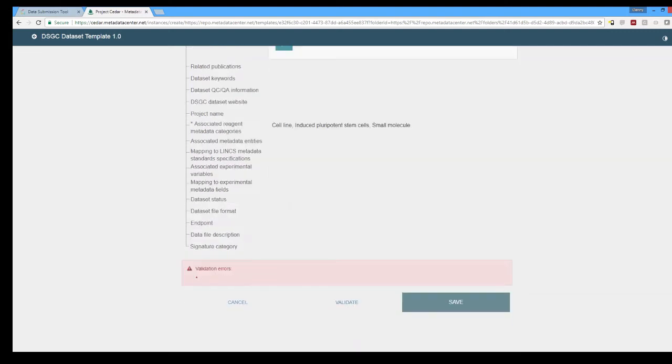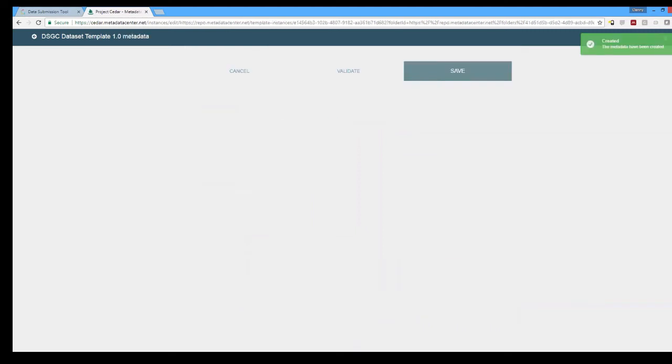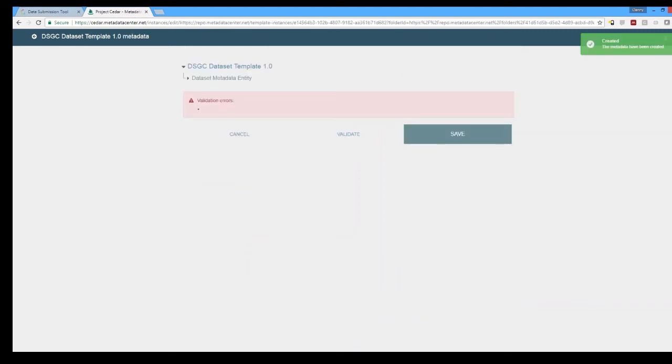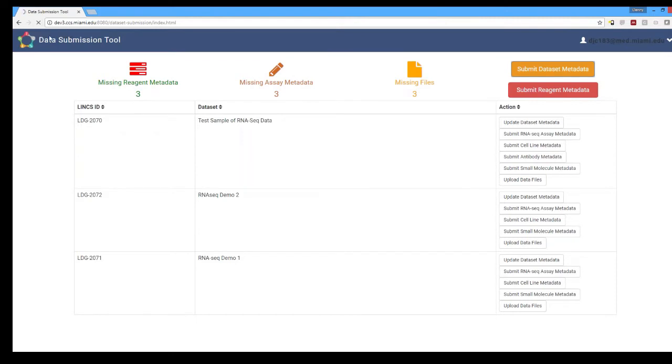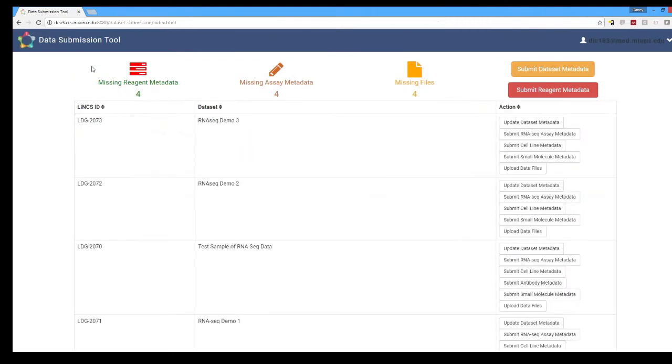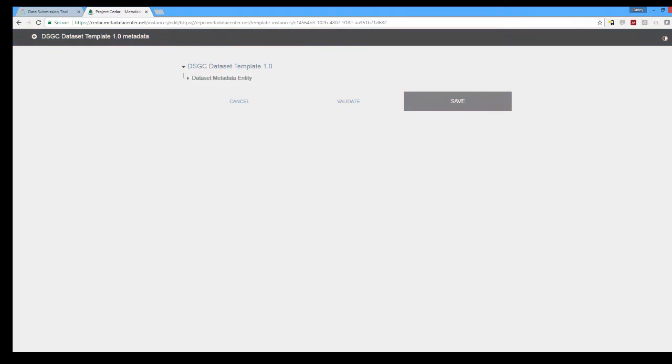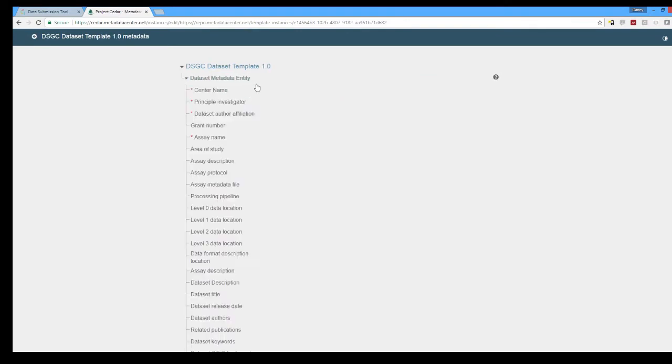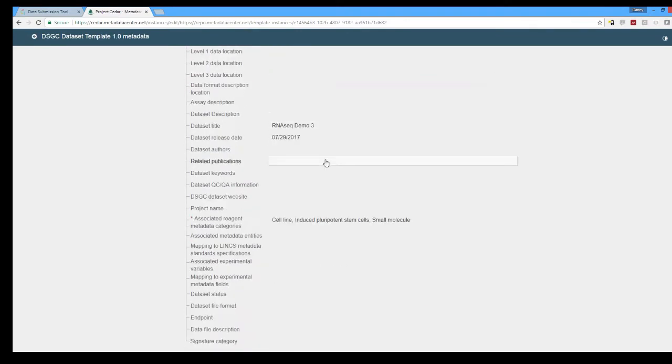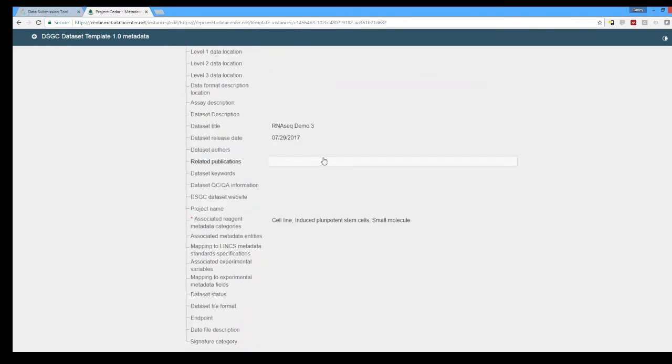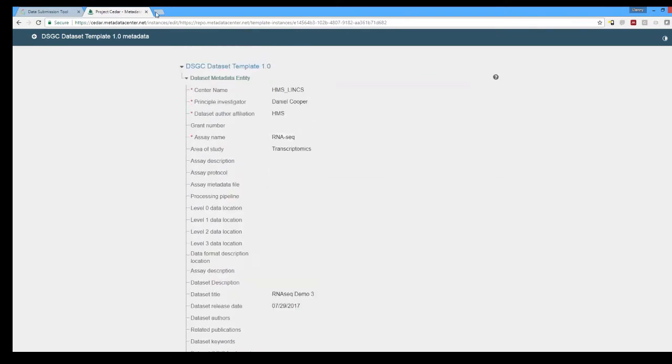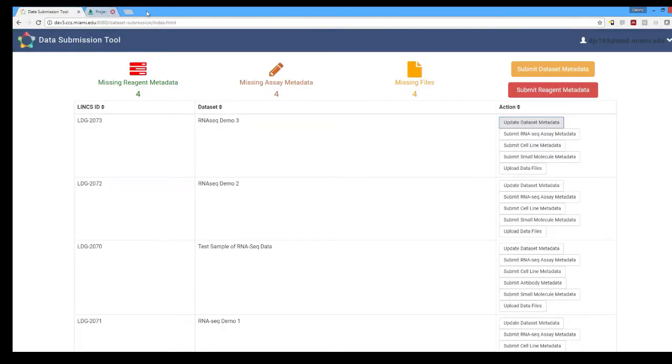So we'll go ahead and save this and then when we go back to the data submission tool and refresh the page now we have our new RNA-seq demo 3 dataset with the individual buttons based off of those checkboxes we selected. One thing we can do is go back and update the dataset metadata in case we get new information or need to update the information at a later time. It's always saved. Same for all the other ones.